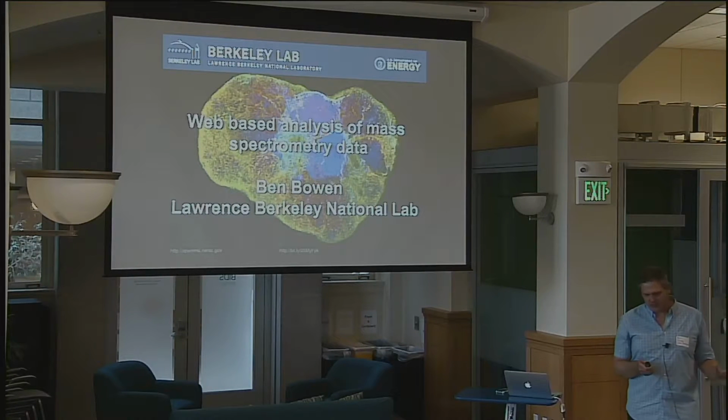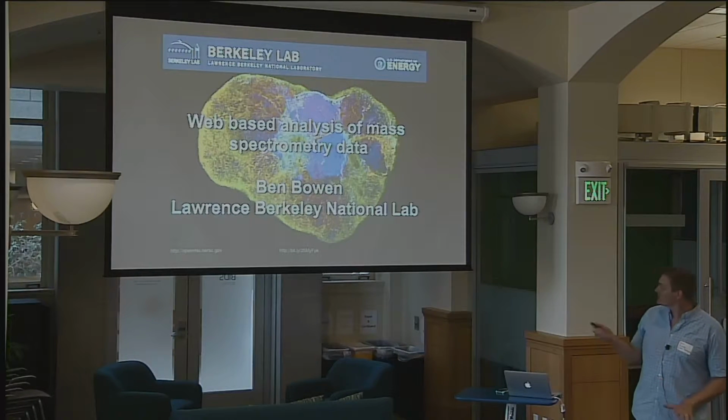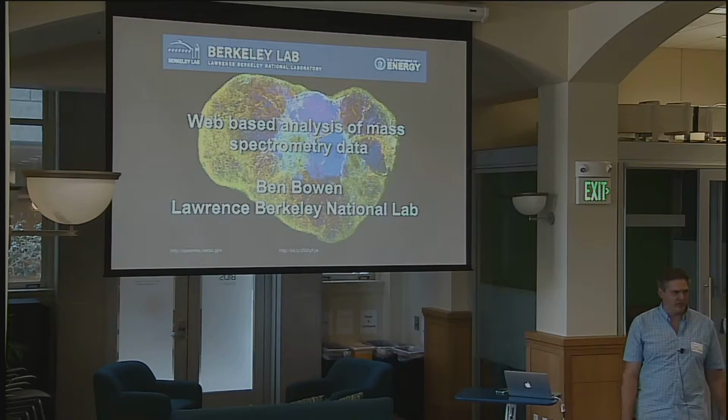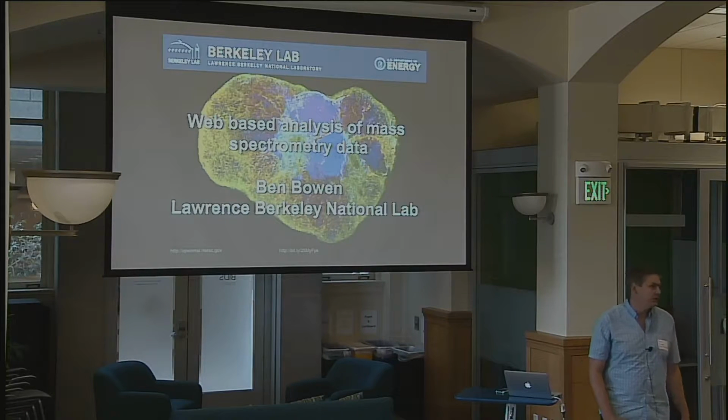Start with an image. Let's see if the pointer works. Yay. This is an image of a tumor. It's a red, green, blue image, something that any image analysis person deals with.